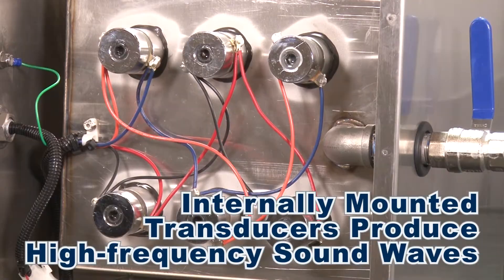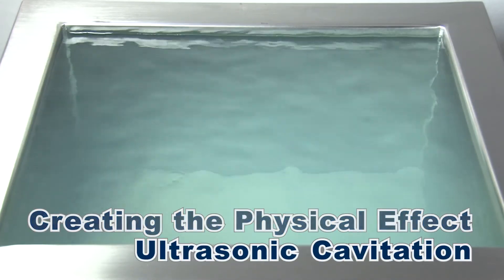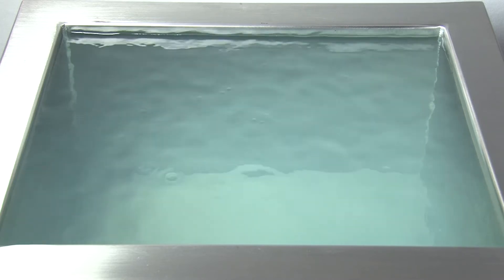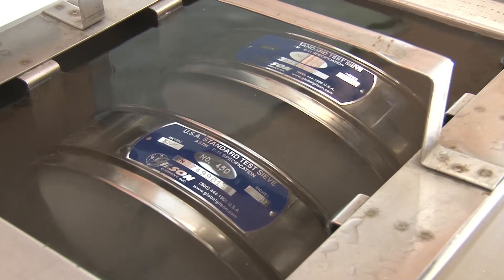Transducers mounted within either the bottom or the side of the tank produce a high-frequency sound wave, thereby creating a physical effect known as ultrasonic cavitation — a process that creates millions of microscopic air bubbles in the cleaning fluid. As the bubbles collapse, multiple pressure waves are formed, gently dislodging particles and contaminants trapped within the sieve mesh.